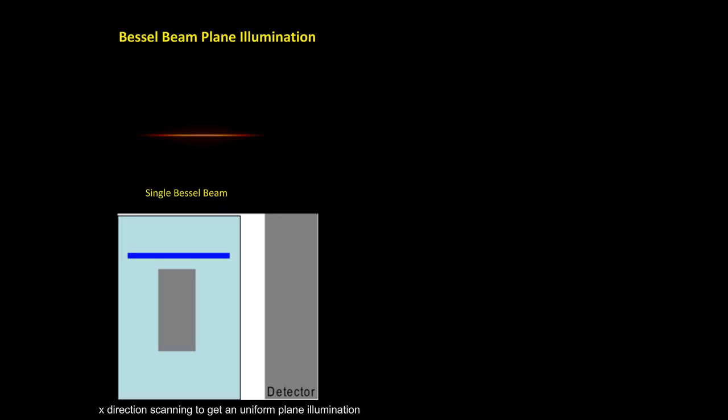The other scanning mode, which we will see in the next movie, is the sample scanning. Simply, we move the sample. We don't move any optics; we just move the sample itself. By these two modes, we can get really good 3D imaging.